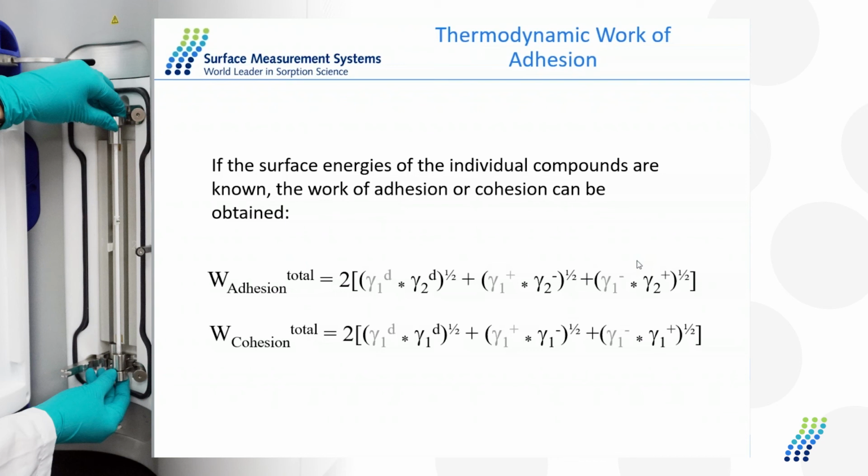If you have an older instrument, I would recommend contacting your local person who's in charge of your territory to see if there's any trade-in options, but there's nothing we can do to upgrade the instrument that's based off the 6890 platform, which was our first generation instrument, which we stopped making in about 2009, 2010.